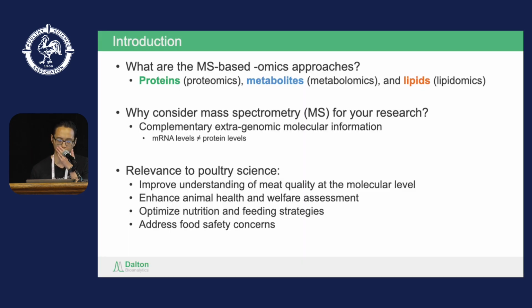So what are the MS-based omics? Primarily, they're non-sequencing type molecules, right? So this is basically proteins, metabolites, lipids, things that can be turned into small molecules. So why would you use mass spec type omics? Basically, it's going to be the phenotypes that are dependent on non-genomic information. For example, nutrients, toxins, proteins like structural proteins, these types of things aren't really readily captured by sequencing type technologies. So this is where it really shines.